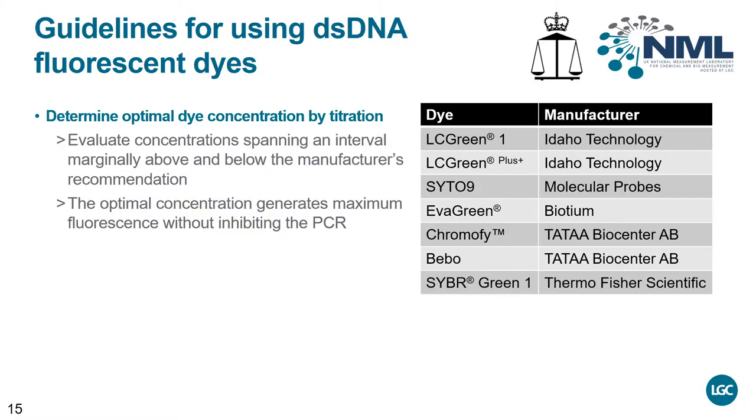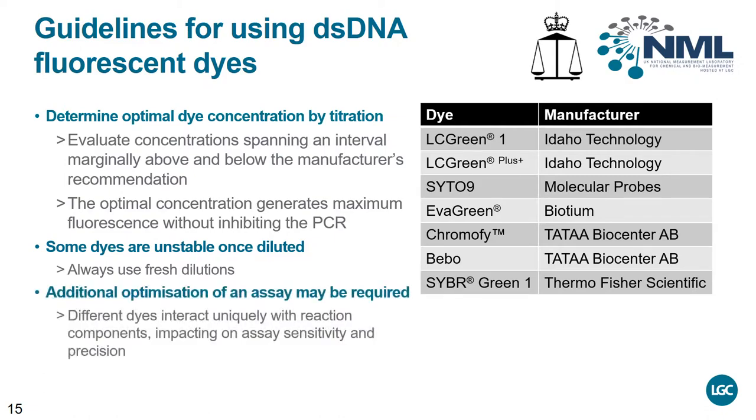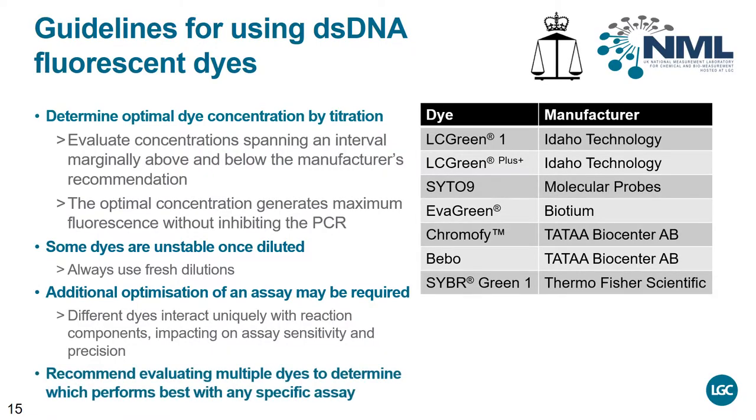These types of dye are photosensitive, so both stock and working solutions should be protected from exposure to light. Many of these dyes are also unstable once diluted, therefore it is recommended that fresh dilutions be prepared for each new experiment. In addition, because these dyes may interact with PCR reaction components, further PCR optimization may be required. Finally, as dye performance can vary with the use of different reaction reagents, it is good practice to evaluate the performance of more than one dye.